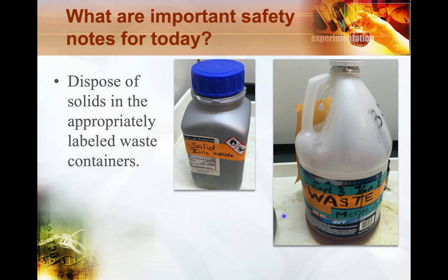Everything that we produce will have to be appropriately put into a waste container. Methanol can be acutely poisonous, so be careful how you use that. Zinc is an irritant, and the zinc iodide can be corrosive if it gets on your skin or into your eye, so be careful with that. The iodine is probably the most hazardous thing you'll use today, but we should completely consume it in the reaction. But again, be cautious, especially at the beginning of the experiment when you're setting up the hot plate and you begin boiling the reaction.